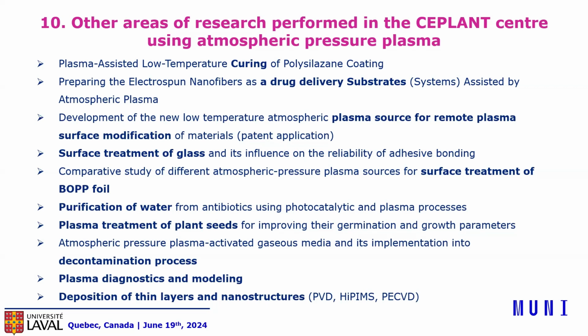In the area of bio application, we are collaborating with some partners in the area of electrospun nanofibers, which can be used as a drug delivery substrate, which are assisted by the atmospheric plasma. We are able to prepare very good nanofibers of PHB polymer due to the plasma treatment of PHB powder before electrospinning. We are testing such materials as a substrate for wound healing of intestine and lungs. Another challenge is to have better adhesion of the substrate to intestine, and we believe that we can achieve it by plasma activation. Also, we have already started some tests.